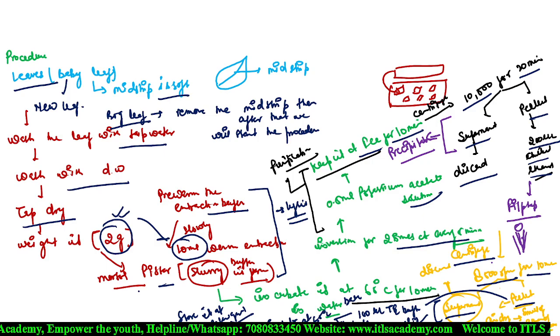Ma'am, I have one more doubt. How are we exactly ensuring that there is only DNA, and not RNA, present? After doing agarose gel electrophoresis, if you get that band, then it is clear that it is DNA. It is confirmed by the method of agarose gel electrophoresis.